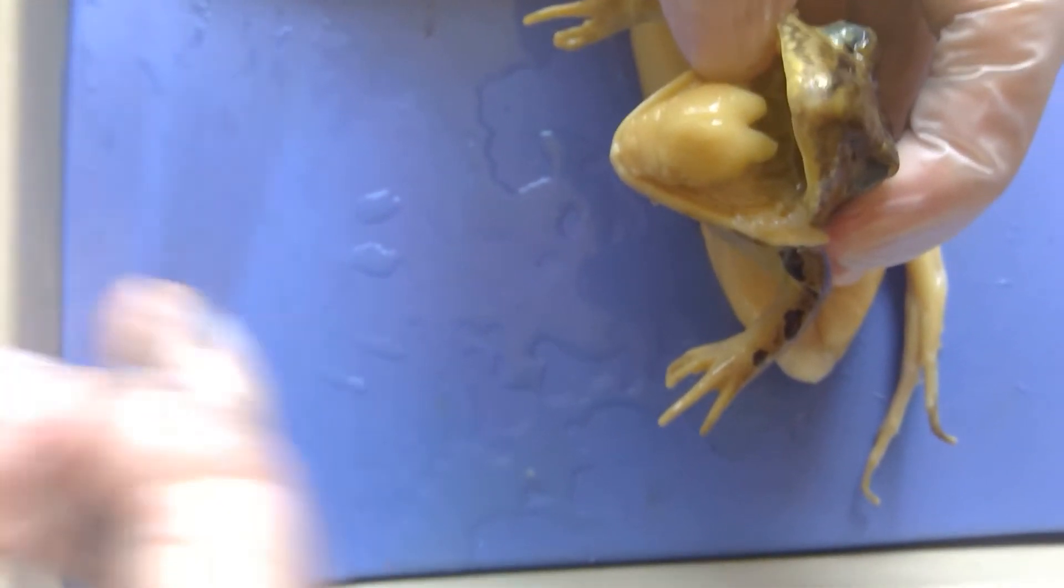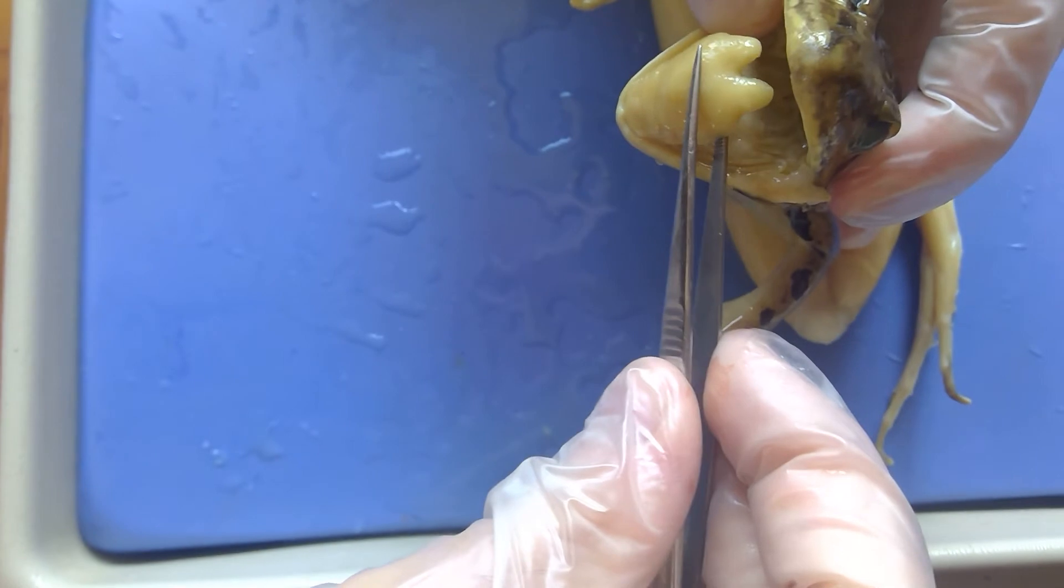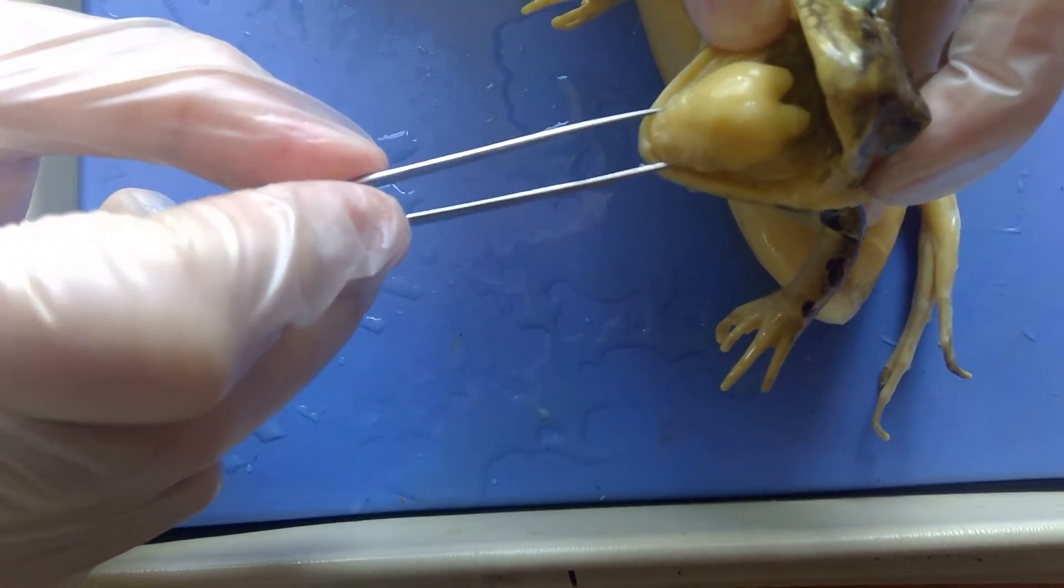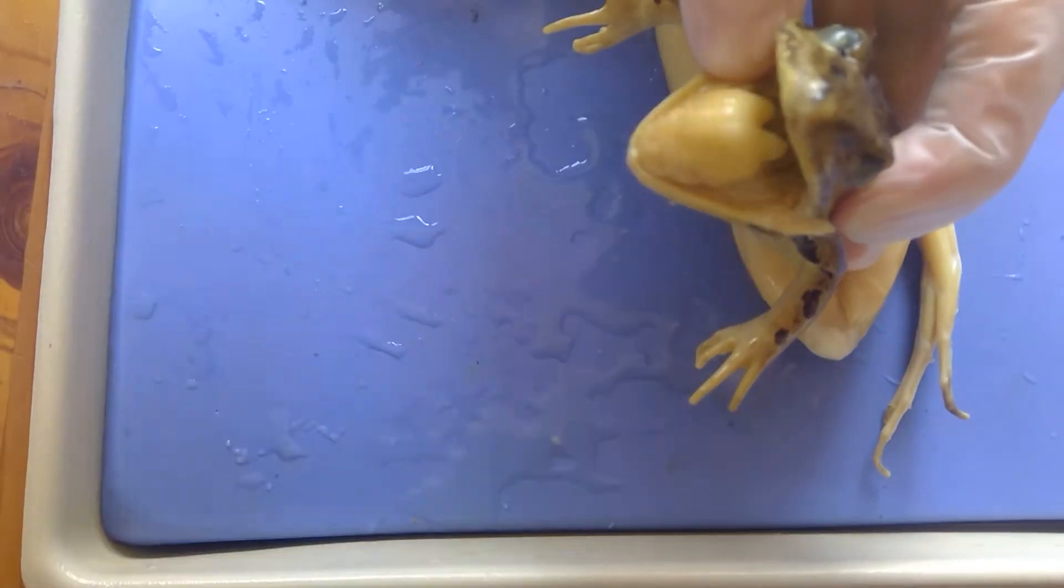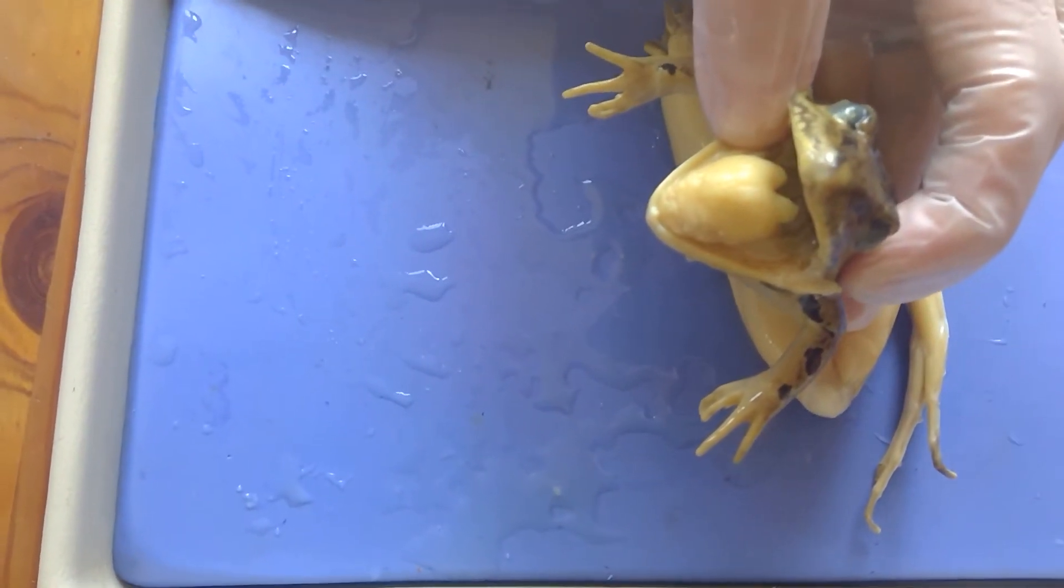And the frog's tongue, if you notice, has these little prongs at the end. The other thing that you note is that the frog's tongue is stuck at the front. So the idea that the frog lashes out its tongue like a lasso is actually incorrect.